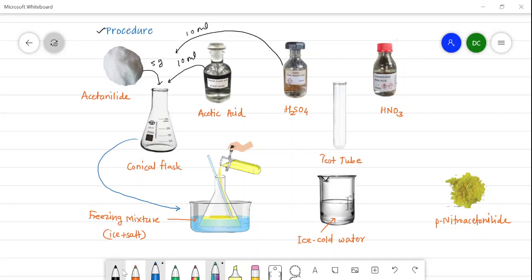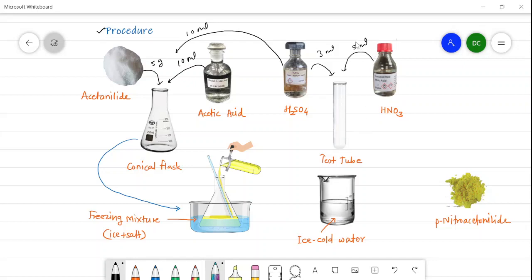In a test tube, 5 ml of nitric acid is taken. Along with 3 ml of sulfuric acid, this forms the nitrating mixture. So the nitrating mixture has a composition of 5 ml nitric acid and 3 ml sulfuric acid. This nitrating mixture from the test tube is then added slowly to the conical flask which is kept in the freezing mixture.